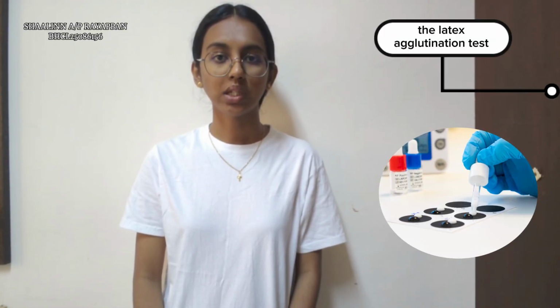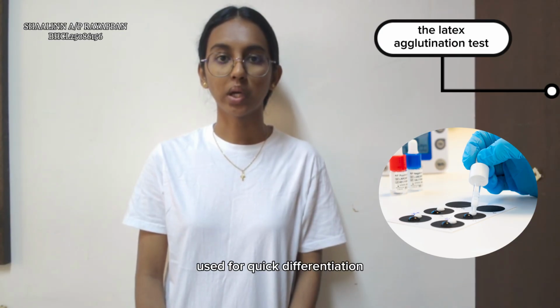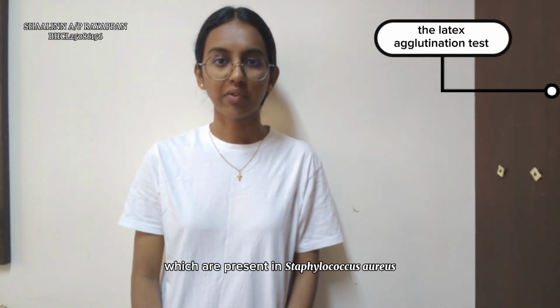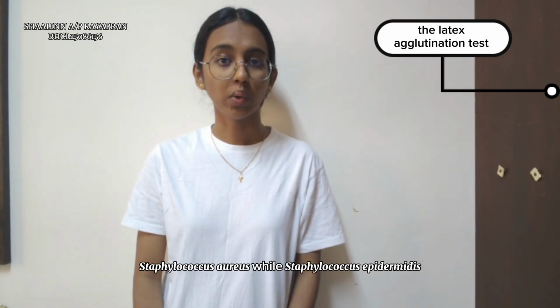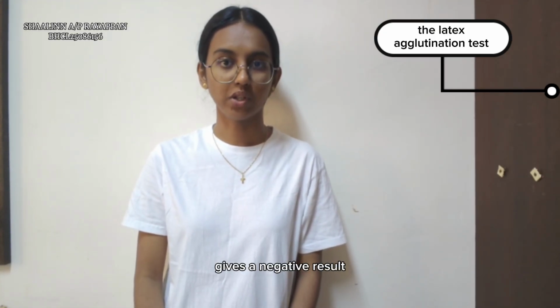Finally, the latex agglutination test is a rapid non-molecular screening method used for quick differentiation. This test detects protein A and clumping factor, which are present in Staphylococcus aureus. A positive agglutination reaction indicates Staphylococcus aureus, while Staphylococcus epidermidis, which lacks these factors, gives a negative result.